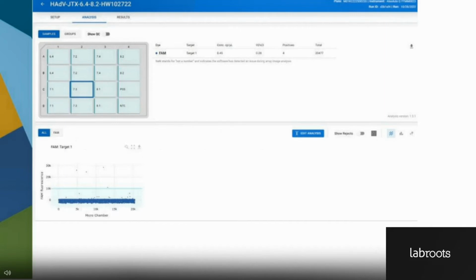In this project, we are trying to find if there are virus pathogens associated with the particles in secondary effluent for water reuse purposes. Since the secondary effluent is treated wastewater, the concentration of the pathogens might be too low to detect. The particle-associated virus is a portion of the total virus, so it might be even more challenging for the detection.